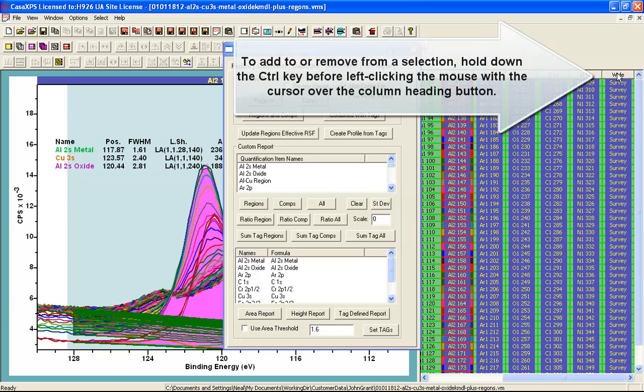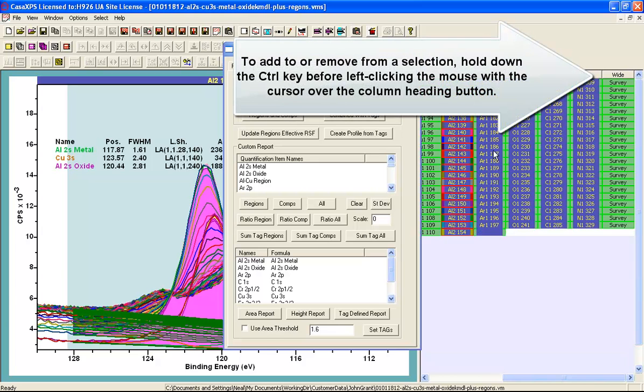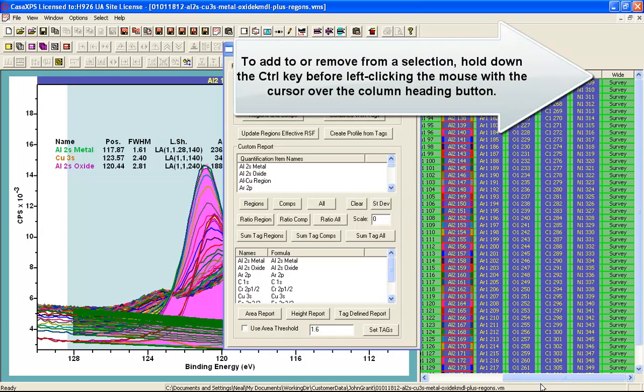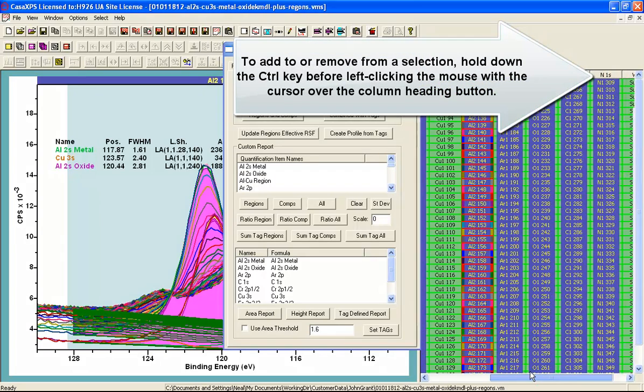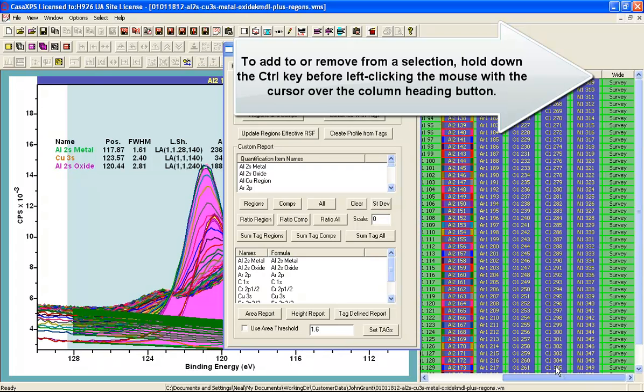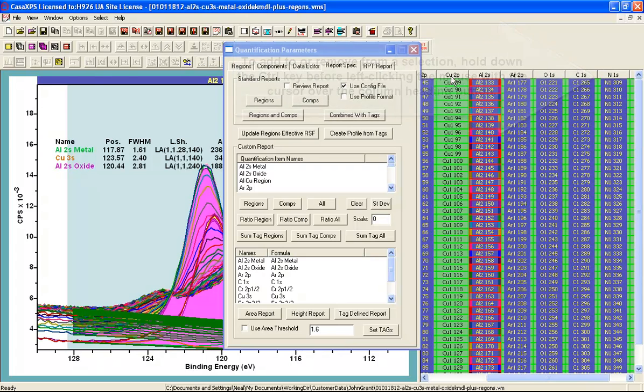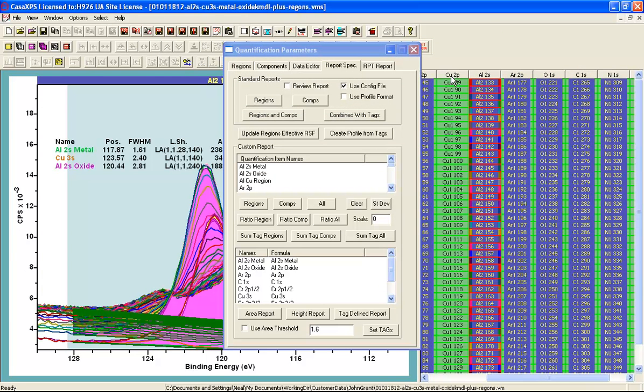So I am going to eliminate the copper 2p and also the wide scans because the copper 2p has a component within the aluminium 2s spectrum that represents the copper 3s and I will use that in the profile in this instance. I have eliminated the copper 2p at this point by deselecting it.